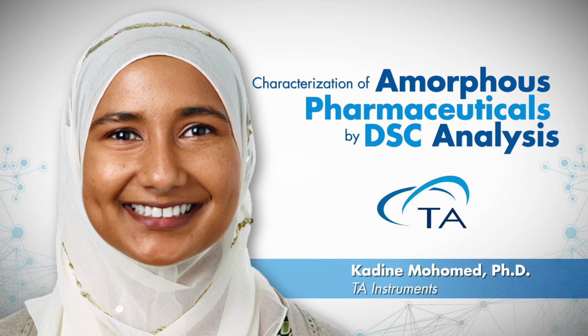Okay, great. Thank you. Next question. Mixing amorphous polymer with semicrystalline polymer sometimes causes the disappearance of the Tg. I found this in literature without clear explanation. Could you please explain why? Is it related to fragility of the mixture, and how to detect it in this case? Okay, great.